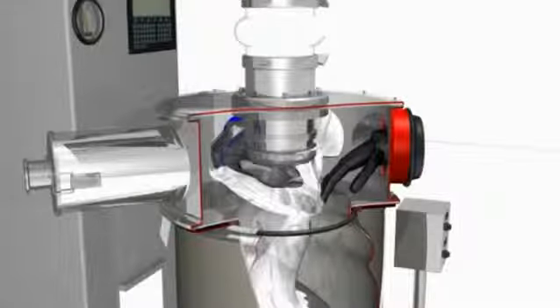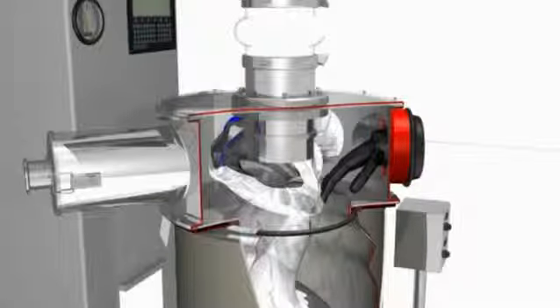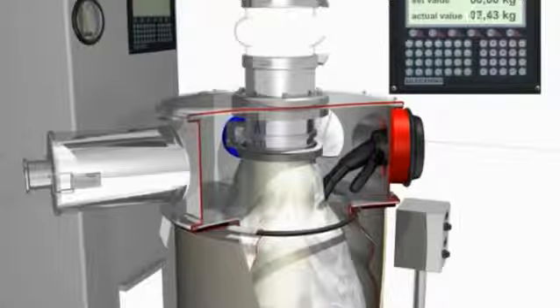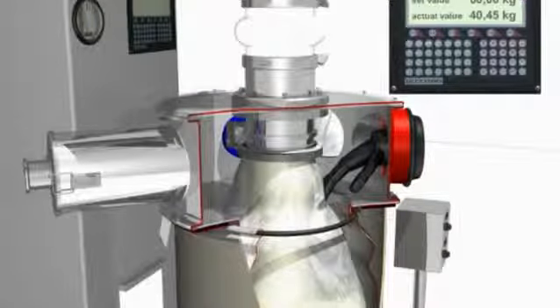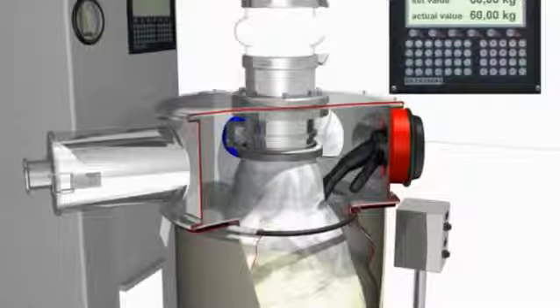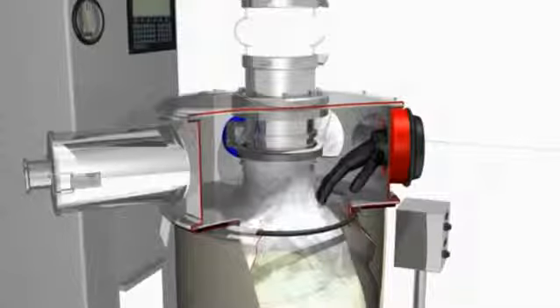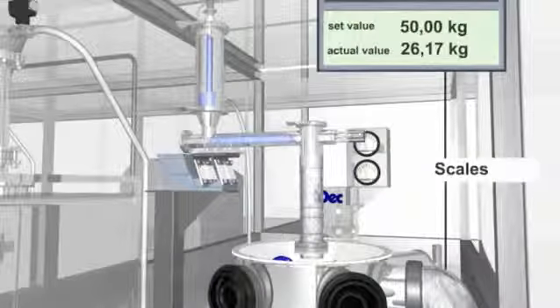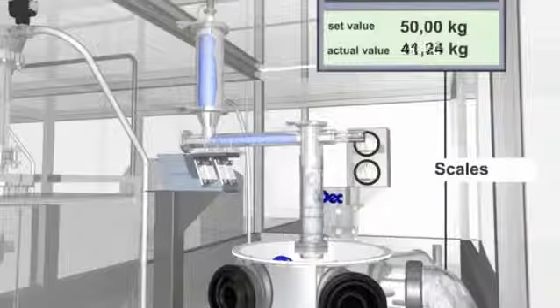Also, as drums come with double-lined bags, the DCS connection system is ideal for fully contained drum loading. As we've seen previously, the system operation is simple. Firstly, a drum is connected into the system above the hopper or silo, or indeed fed from one of our own PTS feeder systems or a trans-batch feeder.